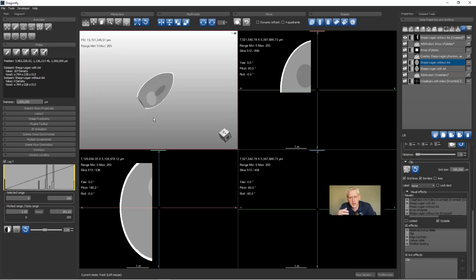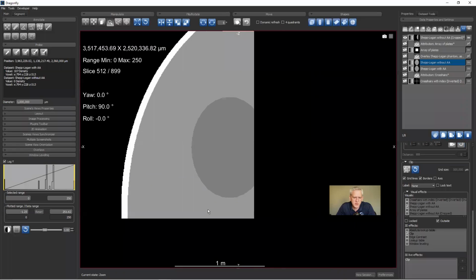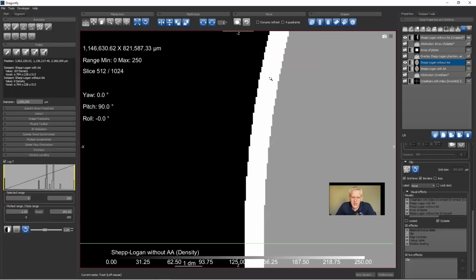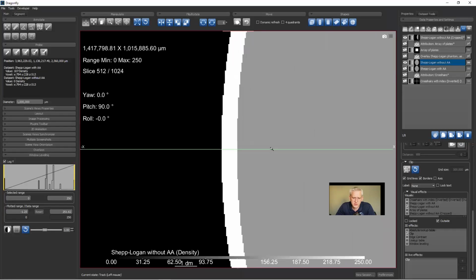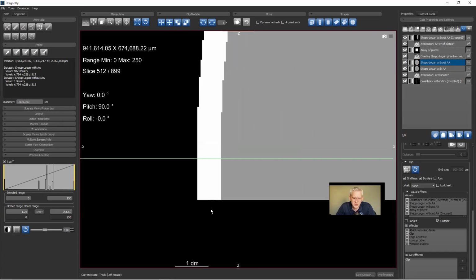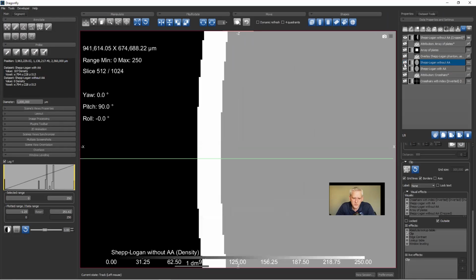Now, this may look a lot like when we used the visual box. However, there are some important differences. If I double click and zoom in, this looks exactly like the source image. So if I turn the source image back on, and then I hide this image, you can't see the difference. The underlying image is down here. If I turn it back on, you can see no difference at the top when I turn this on or off.